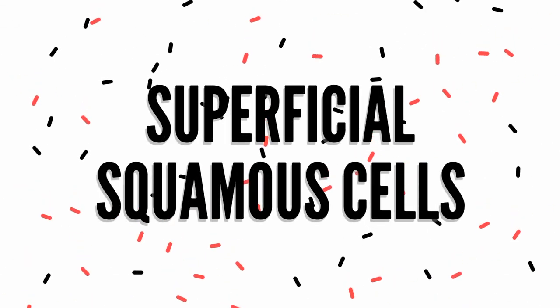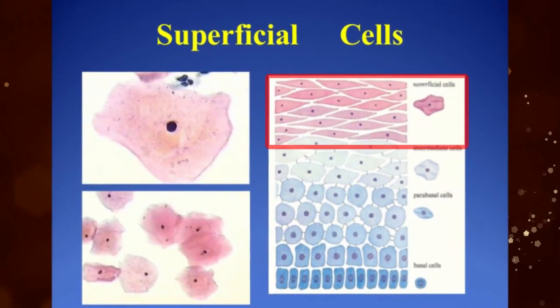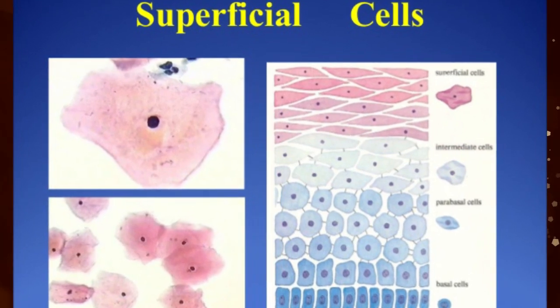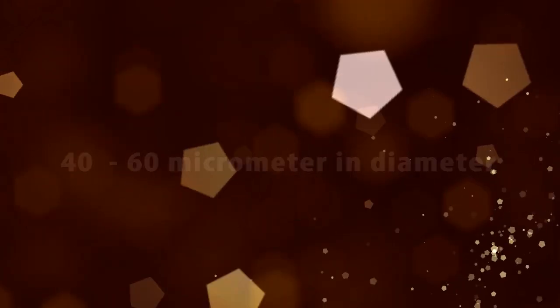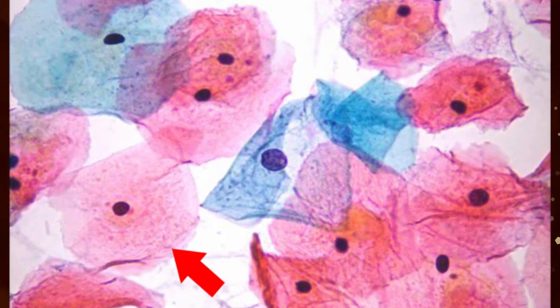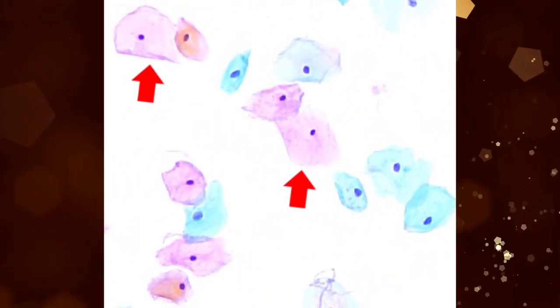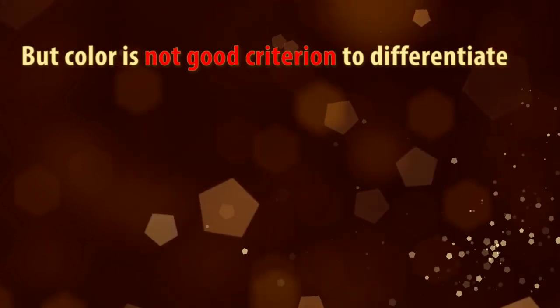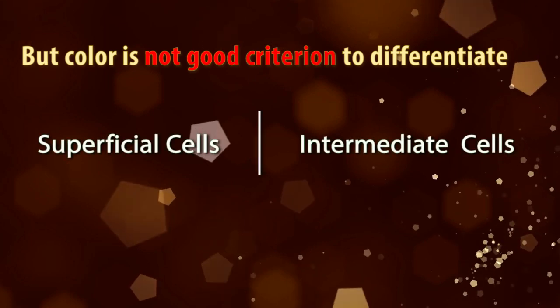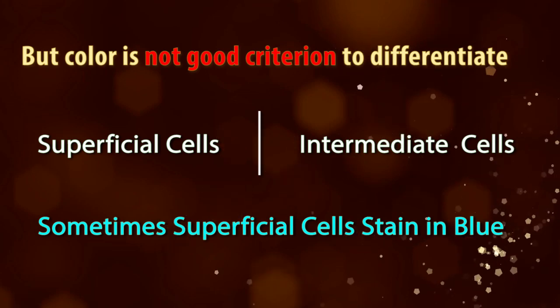Superficial Squamous Cells comprise the outermost layer of the non-keratinizing epithelium. These cells are large and flat polygonal cells, 40 to 60 micrometers in diameter. We can see them singly or in clusters. The cytoplasm is abundant and usually pinkish to orange in color, and occasionally folded. However, color is not a good criterion to differentiate superficial squamous cells from intermediate squamous cells, because sometimes superficial cells also stain blue.